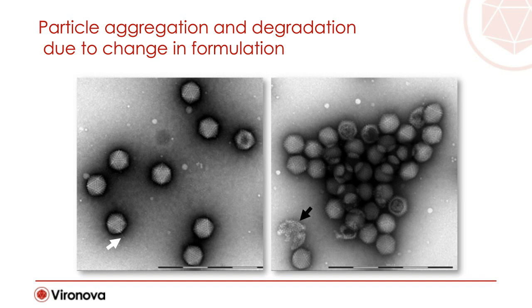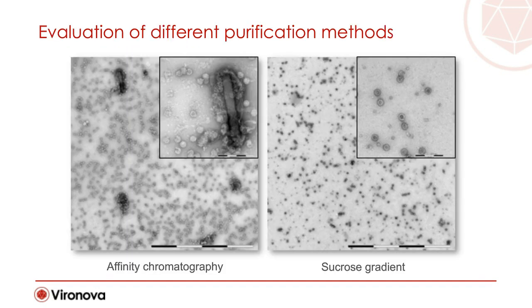You can, of course, also analyze your purification process. How does my product look before and after certain steps? Or compare different purification methods. Here we have an example of picornavirus-like particles purified with two different methods.